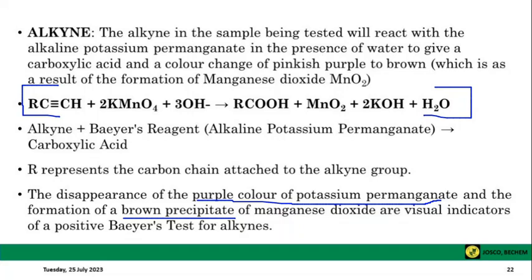This is said to be a positive Baeyer test. Positive in the sense that indeed there is presence of an unsaturated compound, in this case an alkyne.